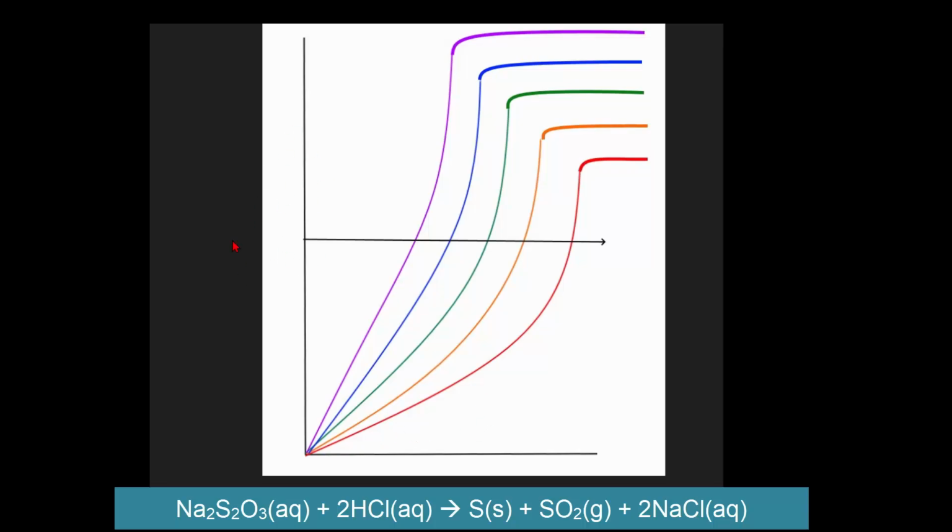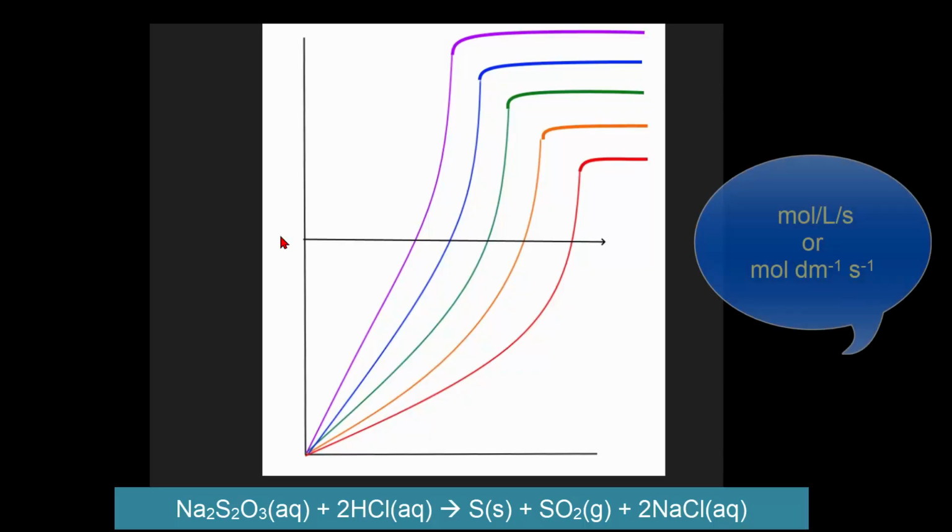So to do it properly, you should do the decrease in moles per second. Now we just did the quick and easy way to do it. And you should also do initial rates because the temperatures are changing and also the concentration of reactants are changing. And for this one, the catalyst is actually increasing as well. So the only time you get an accurate rate of reaction is initial. You have to draw a tangent to the line.